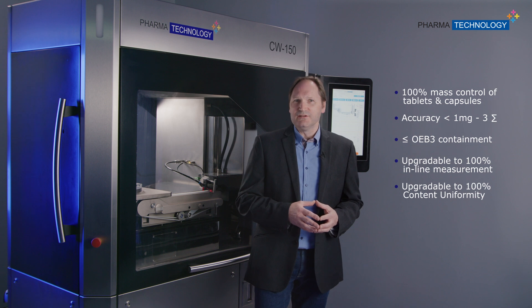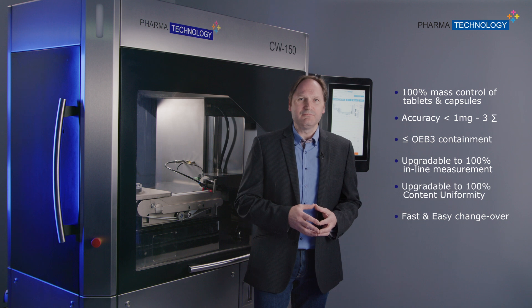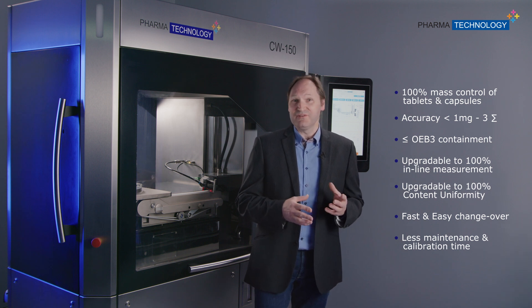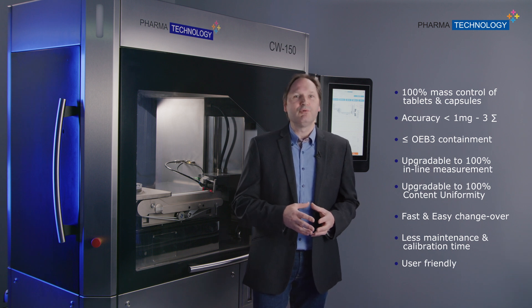In addition, the changeover is fast and easy, and the machine requires less maintenance and calibration time thanks to its single-lane architecture. Last but not least, the machine has an intuitive interface and is simple to use thanks to a smart HMI and CFR21 Part 11 compliant software.